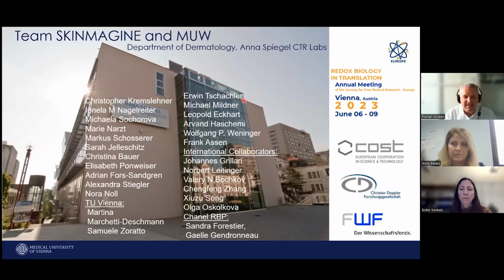So there is a possibility in simple methods to see already big changes in, for example, oxidative modifications or epilipidomic modifications, and then the specification and the localization need the other technologies I showed today here. Thank you very much.